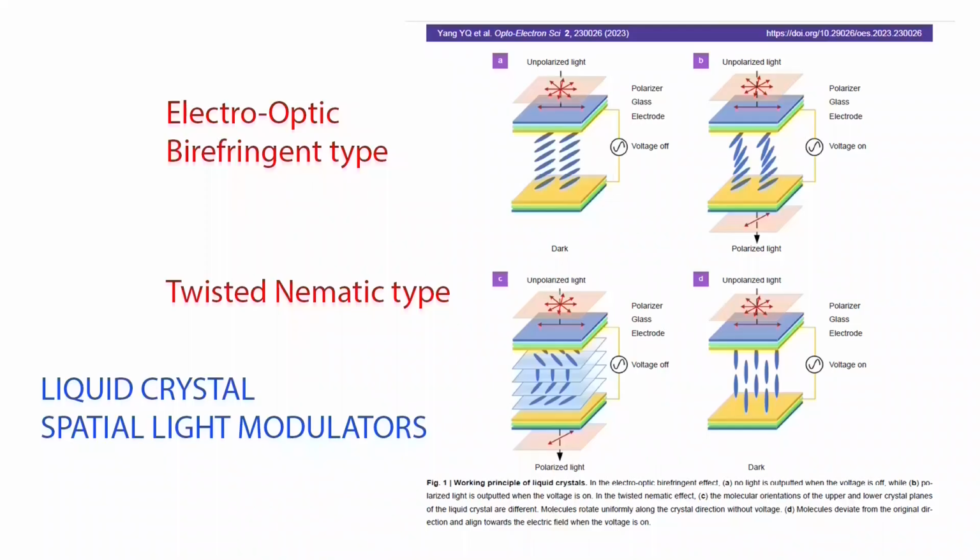Masking or modulating effects can be achieved using pixel-based liquid crystal spatial light modulators, or SLMs. These thin devices can be used both in the illumination and in the Fourier plane. SLMs can modulate intensity, phase, polarization, and colour for diverse methods.